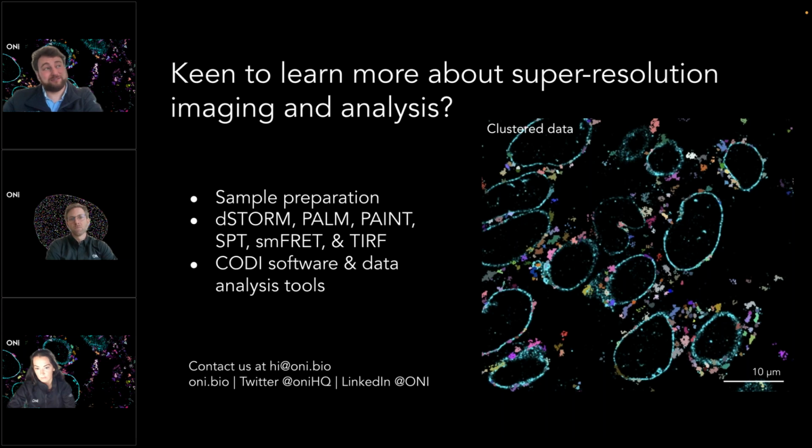Actually, some of them have been optimized with some Rust code as well, but generally Python. At the moment, it's not open source while it's still in this closed beta stage. As we add customer analysis tools, we'd like to show the underlying algorithms and how they're actually working, for reproducibility.